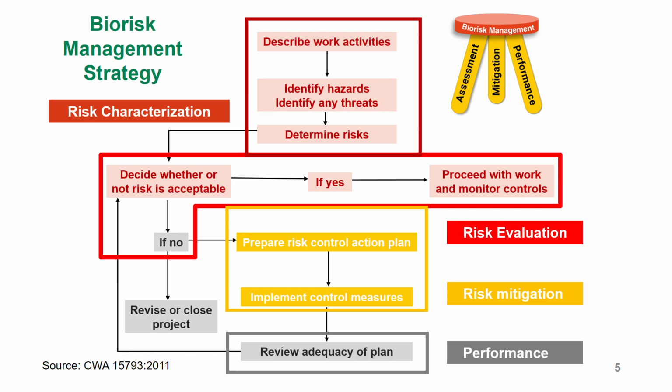So of course you need to check their risk assessment. Check that they actually did a good job on risk assessment, that they've actually reduced or eliminated the risk of testing for Ebola. Because what you don't want is referring samples to another laboratory, and then you find that you overwhelm them and they start getting exposed because they didn't really do a proper risk assessment. So make sure you check their risk assessment as well. So that's one of the ways you can revise.